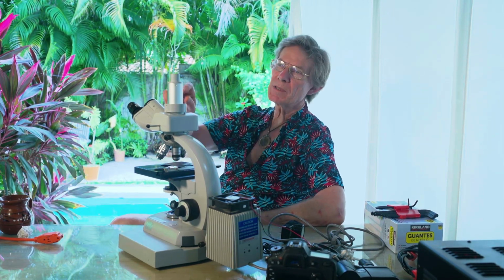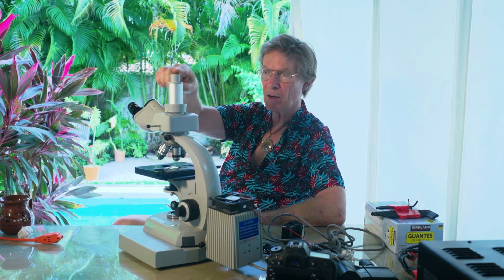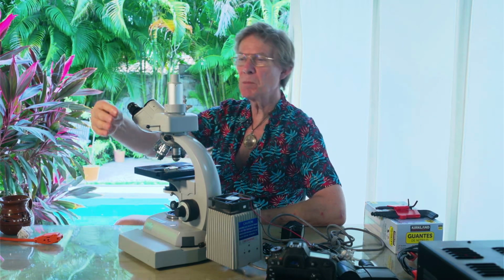So let's move to the topic of the camera. Okay, rolling. So let's talk about the camera. You remember we said the camera goes here on the trinocular part of this setup. And the light is split by pulling this in or out. And the light then, when this is out, some of the light will go to the camera and allow the camera to take an image.